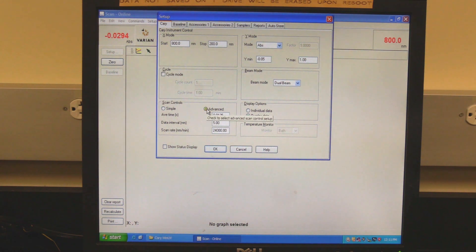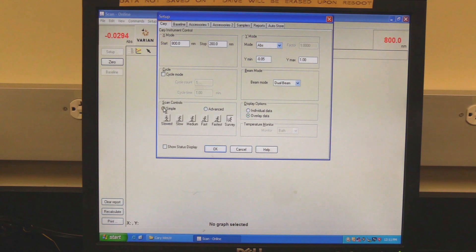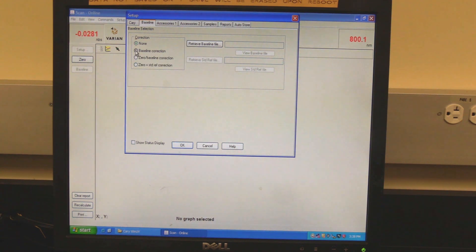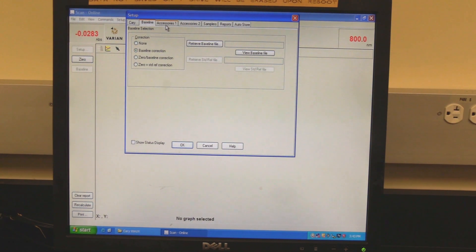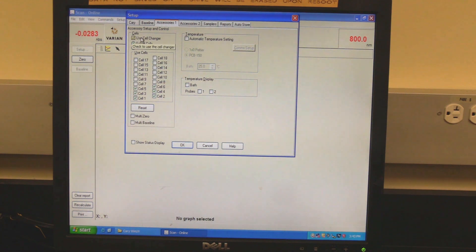If advanced is selected, set the average time and data interval — scan rate will automatically be calculated. In display options, set whether to display data individually or overlay. Click on the baseline tab. To automatically subtract the baseline, select baseline correction. Click on the Accessories One tab. To use the cell changer, click the Use Cell Changer box and check the boxes for the desired cells.